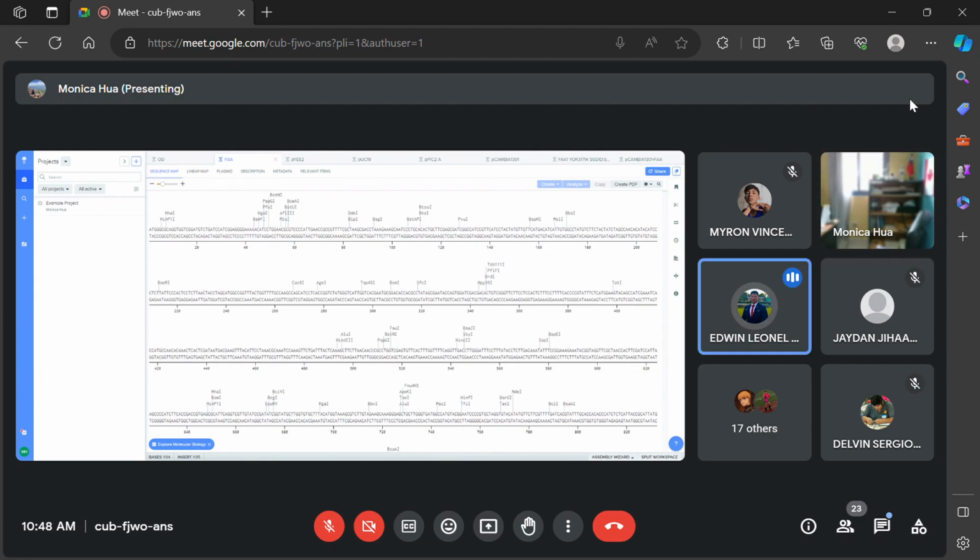pCambia, for XbaI, it doesn't have it, so I guess maybe that one could work.